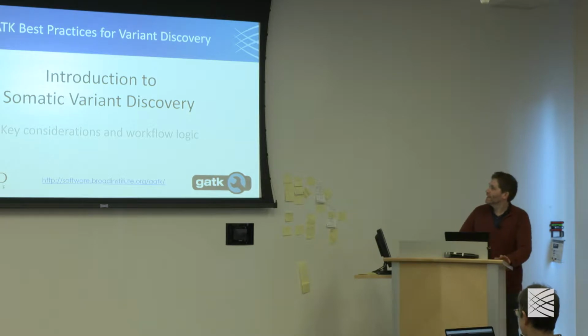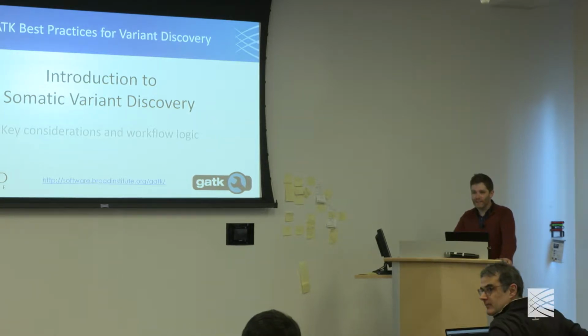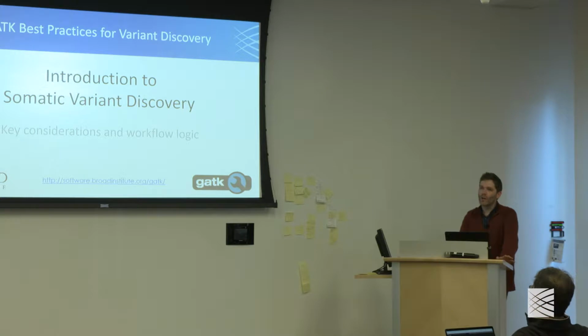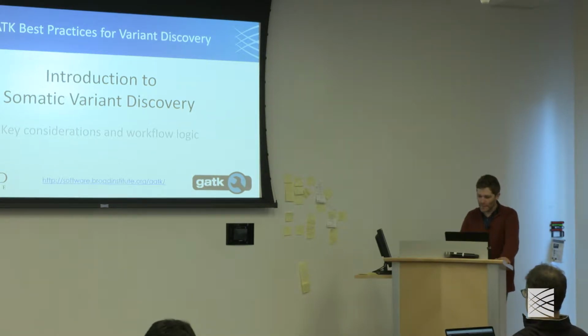So today, I'm going to be talking about somatic variant discovery. And if you think to yourself, well, what's somatic variant discovery? Don't worry, it's in the slides. So we're going to be talking about an overview of somatic variant discovery, as well as a bit about the workflows themselves to do somatic variant discovery in the GATK.